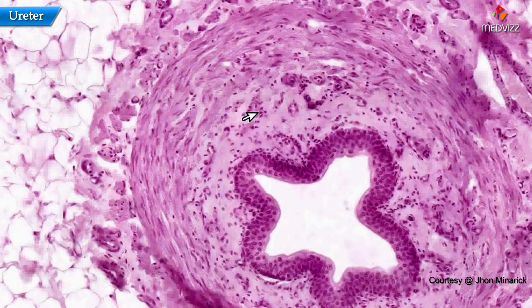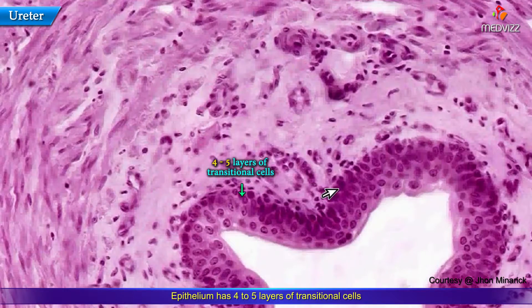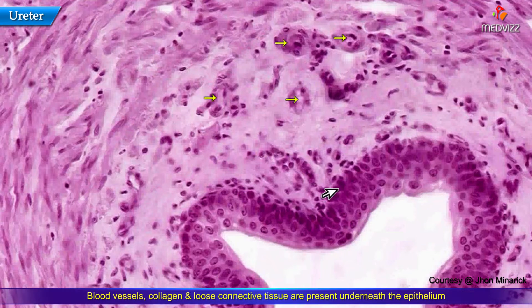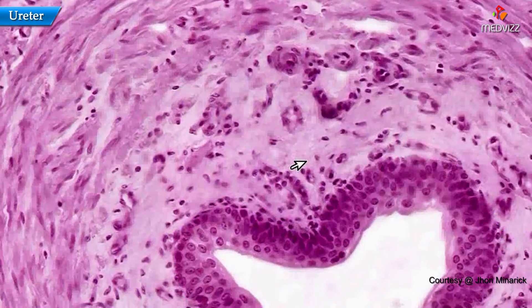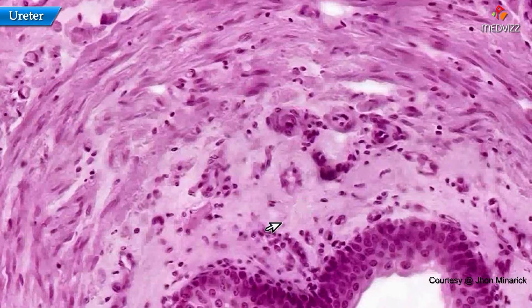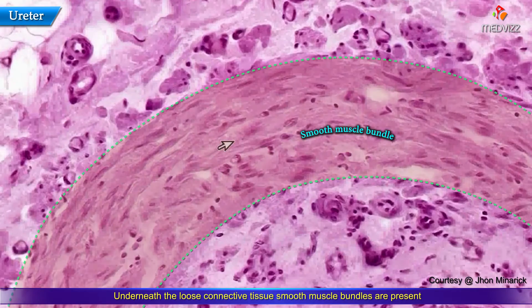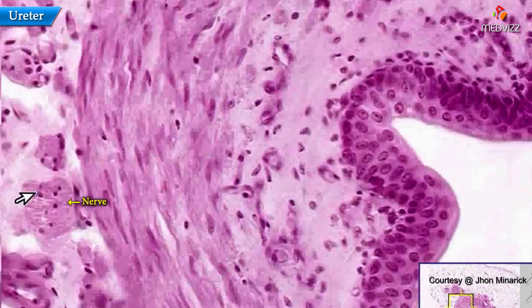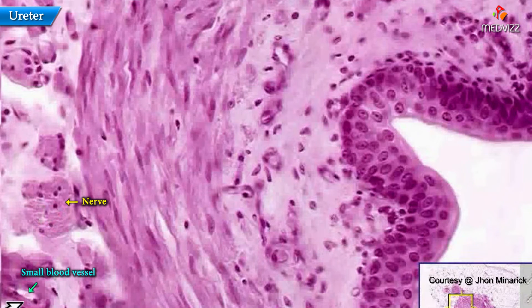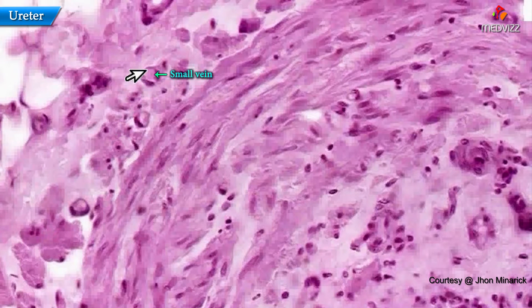You have four or five layers of transitional cells. You have some blood vessels and collagen and looser connective tissue in the area directly underneath the epithelium — if you want to call this a submucosa, you may. You then have some circularly arranged smooth muscle bundles, and you may find some little nerves and blood vessels surrounding here. This looks like it could be a nerve; here's a small blood vessel — that could be a nerve — here's a very small blood vessel, perhaps a capillary or an extremely small vein.